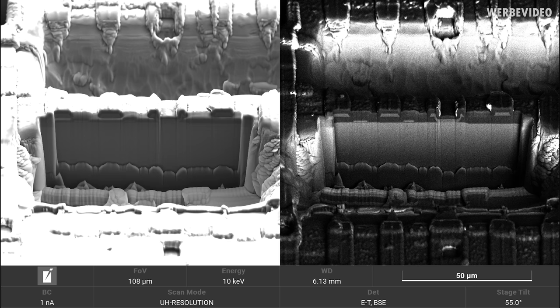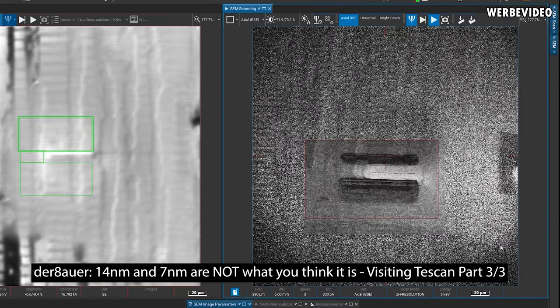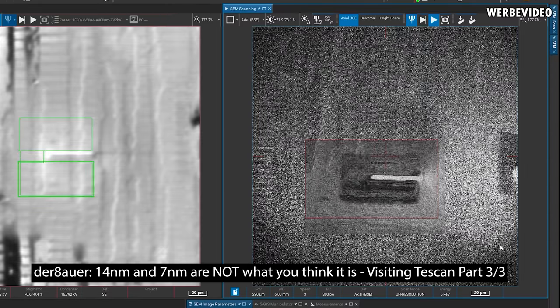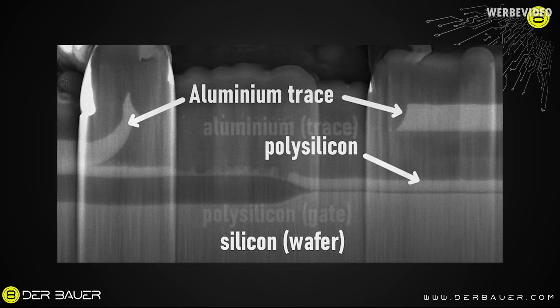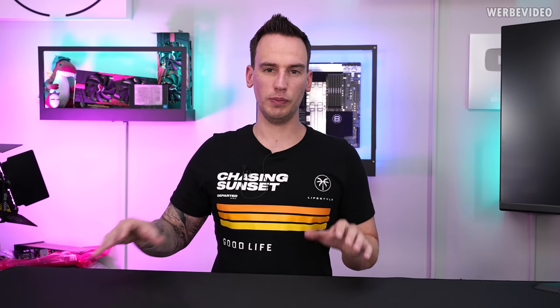TESCAN made some further cross-sections for us — basically cuts from the side of the die. For this, they use a focused ion beam to cut holes into the chip. Using the ion beam to cut through one of the connections formed by a trace above, you will see that the trace forms a connection to the lower layer, which in this case would be the silicon. If we zoom in further, you will see that both are made out of different materials — aluminum and silicon — that's why we see different gray scales on both. At this point, we just didn't know what we were actually looking at.